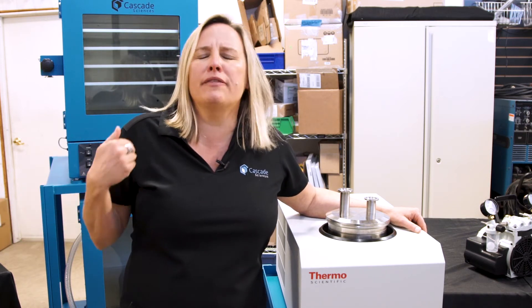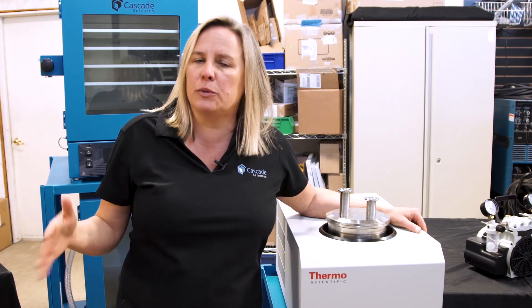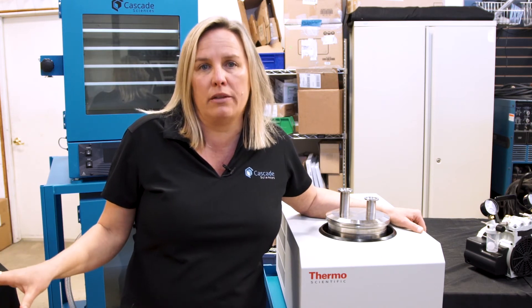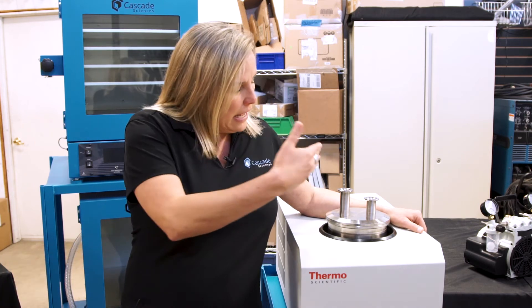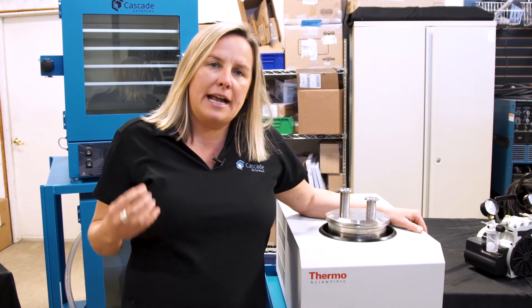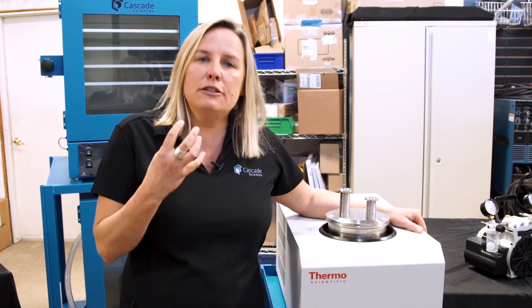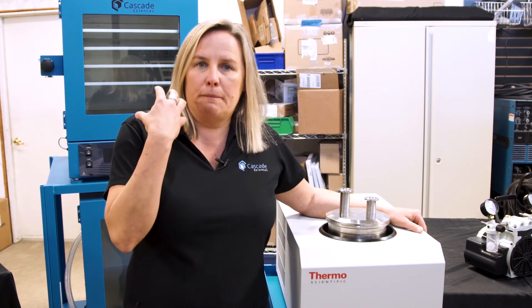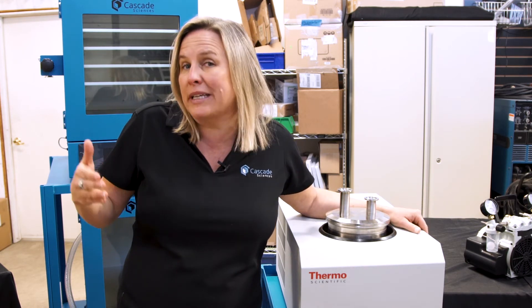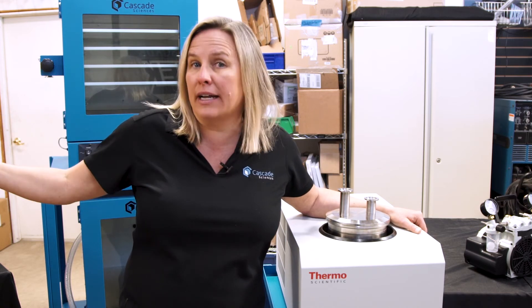Take some of that plant material pre-extraction and put it in a vacuum oven at an extremely low temp, because we do not want temperature to degrade the quality. We want to let the pressure change do the work. Have that vacuum oven hooked up to a cold trap — that is where you'll get the lion's share of terpene preservation, the low-hanging fruit that may otherwise be lost down the chain as you extract and refine.